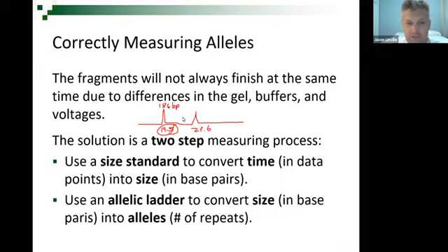And now I know what you're thinking. You're thinking, oh, 186 base pairs. Well, you can just add it up and find out how many 4 base pair repeats are on there. Unfortunately, you can't, because this base pair size is actually an estimation. So on some days, a 9 allele may be 185 base pairs. On other days, it may be 187. So that's the confusing part, because we use whole numbers, but just understand that that size is actually an estimate and not necessarily the true measurement.